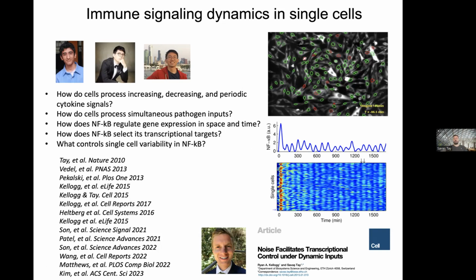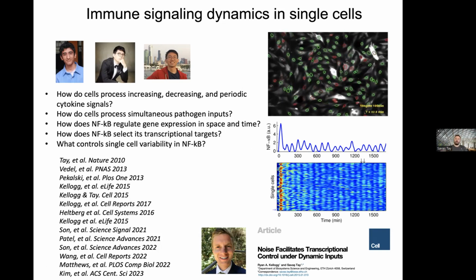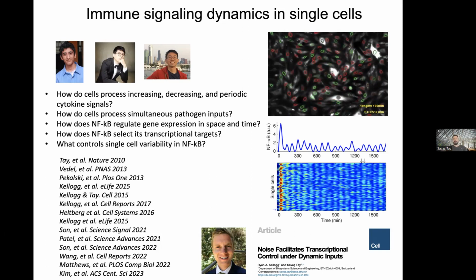These kinds of questions are all very interesting and have been the topic of research both in my lab and in other labs in the past. And oftentimes we use, as you can see here in the movie, live cell analysis.